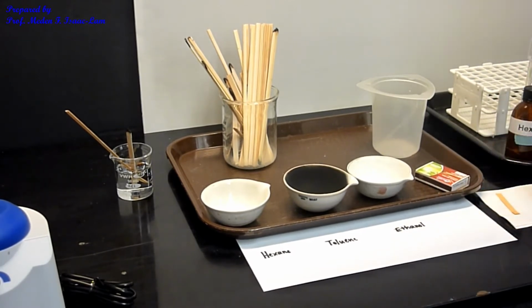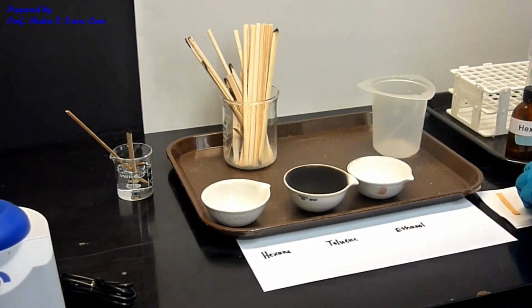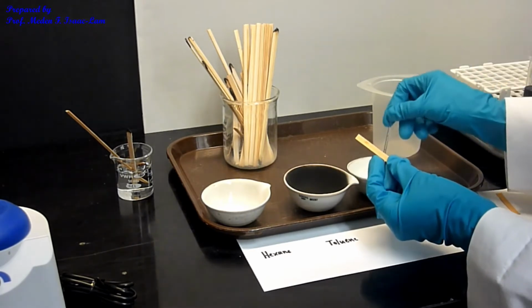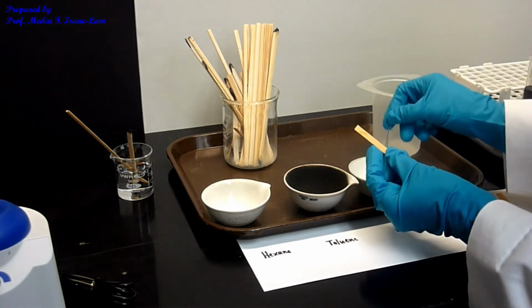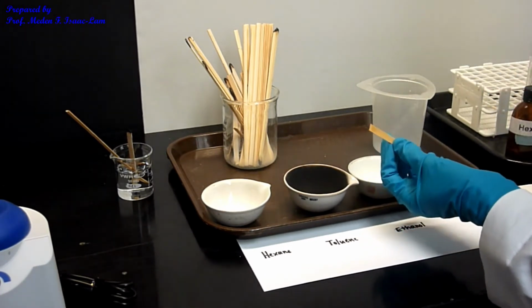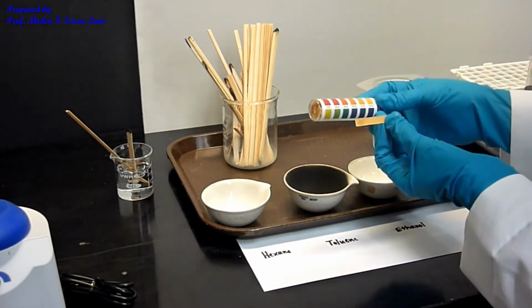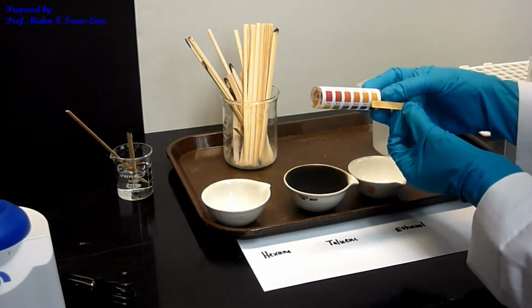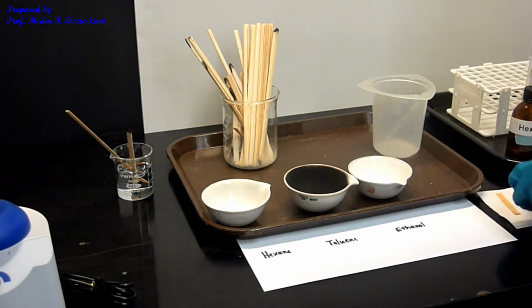So that one is ethanol. So again, my stir stick. Okay. So I put little droplets in here, but it's actually the same, like 6. Okay, that's the color. Right? So I can use the other end later.